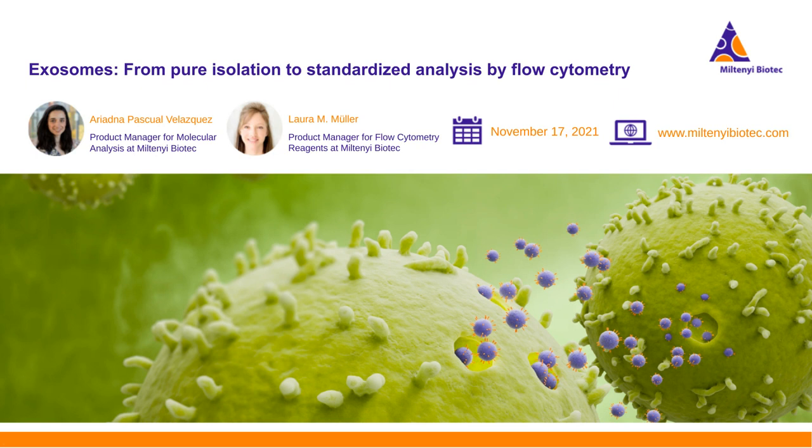So if you stain with two different antibodies, of course, you will not know whether these antibodies stain on the same vesicle or on different vesicles, because, of course, on one bead, many vesicles can be bound. Therefore, it's in principle possible that the staining comes from two different vesicles, giving a signal on the same bead type. So you always can detect two markers on the same vesicle, but you can combine this with different markers, of course, to get more information on these vesicles.